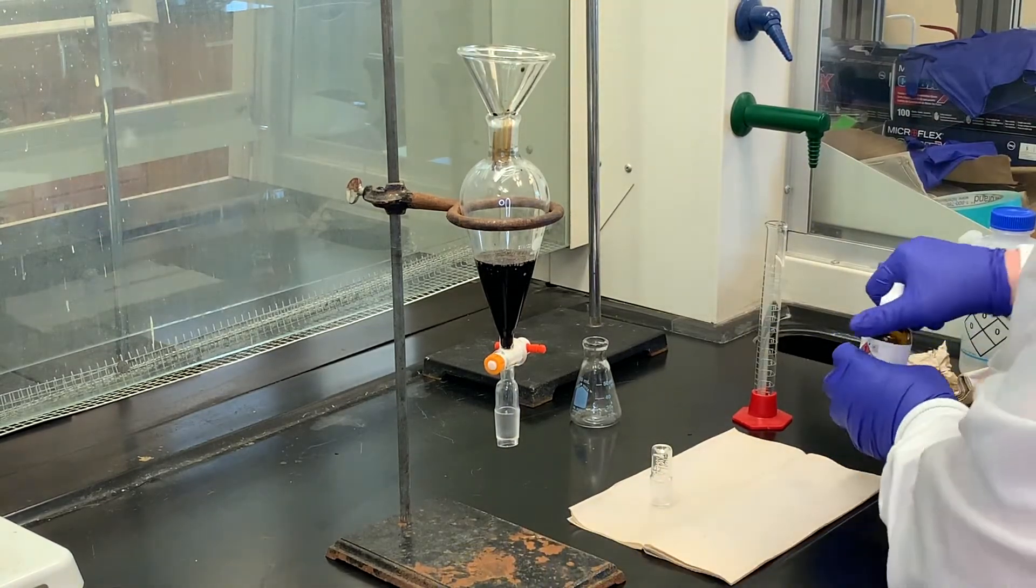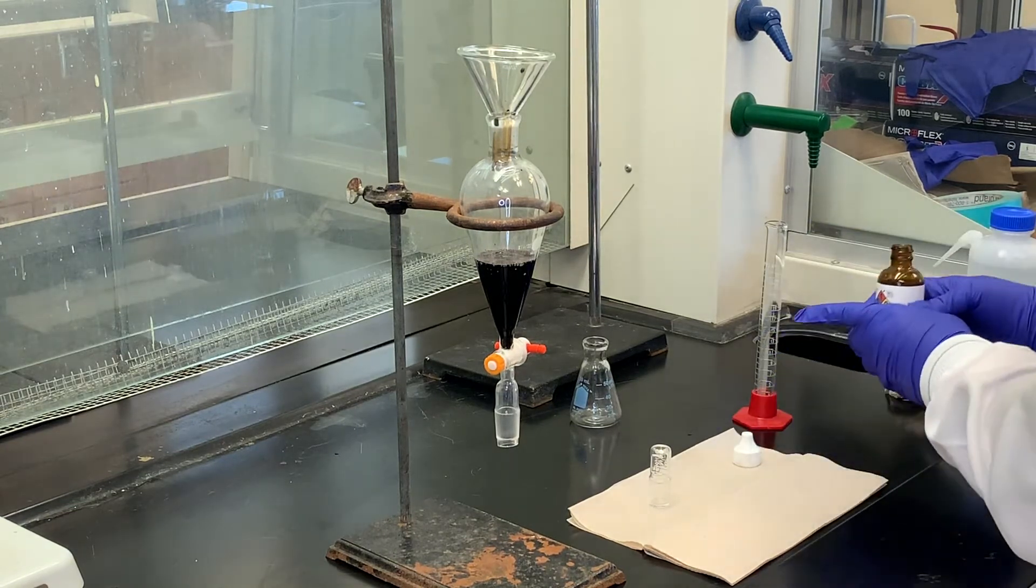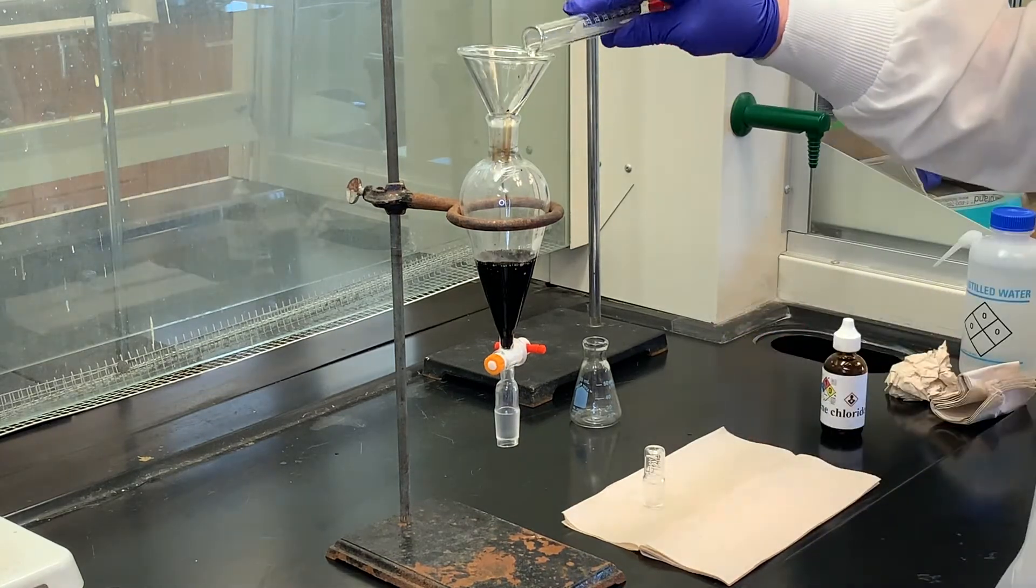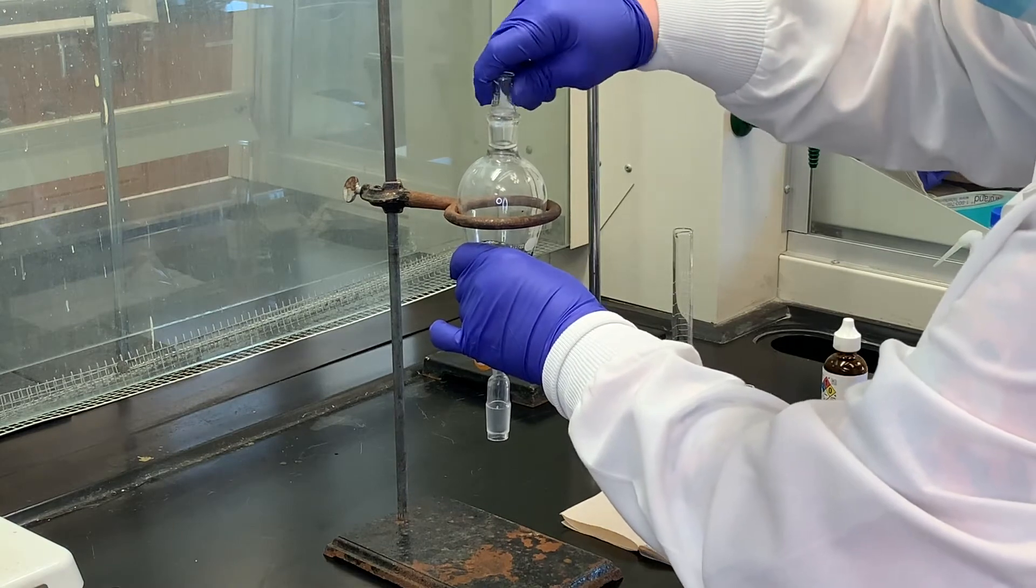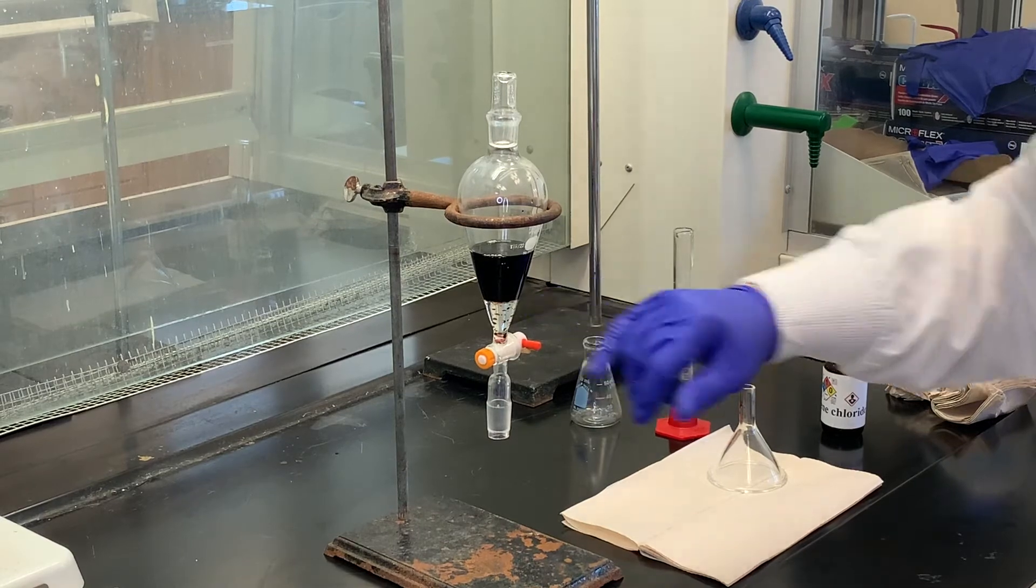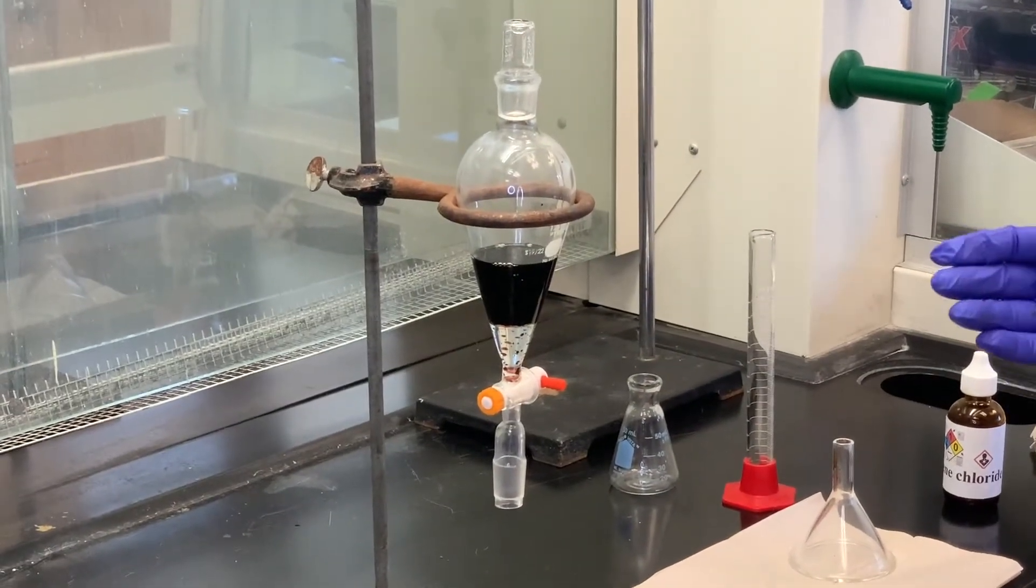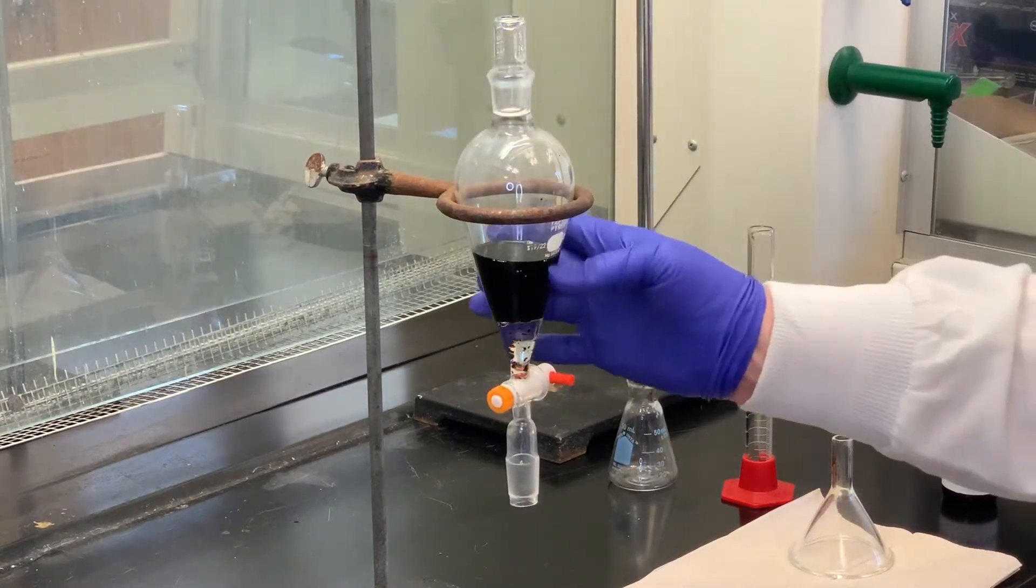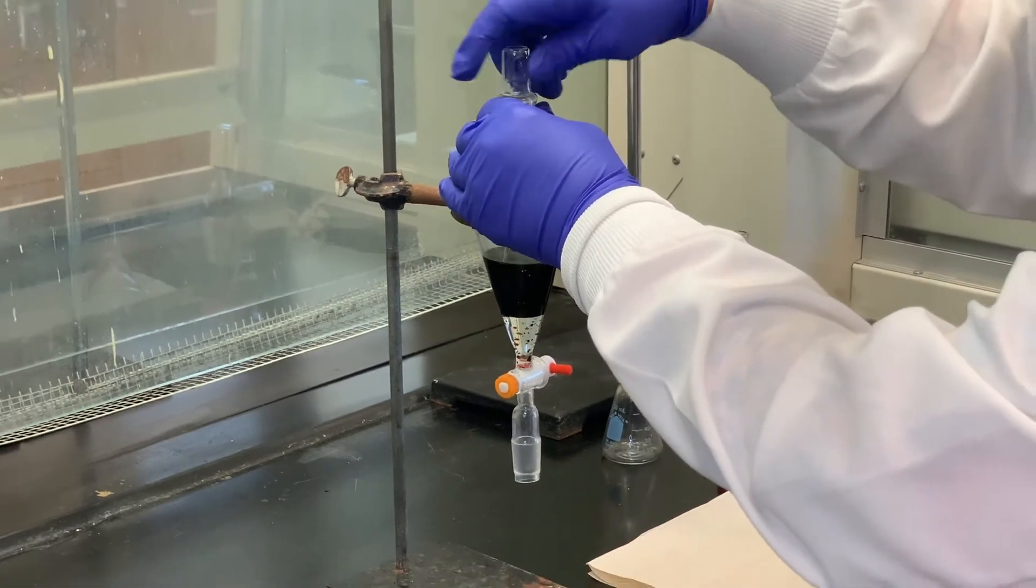And then to that, I'm going to add somewhere between five and 10 milliliters of the methylene chloride. Now, if you notice, we've already got two layers that have formed. This colorless solution at the bottom is the methylene chloride. But we need to mix this up because if we don't, we're never going to get all the caffeine to come out. I'm going to open this up and put it back in.